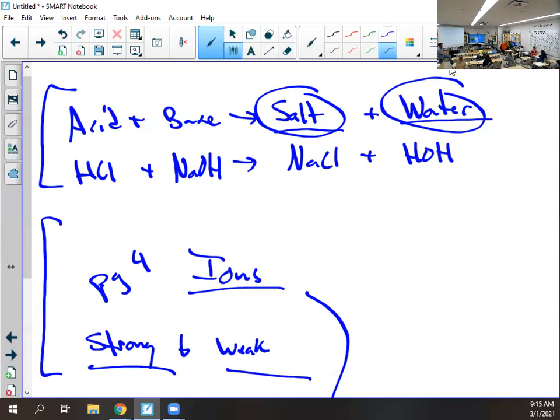That's appreciated. All right, you compare it to this and you'd say, that's probably an 11 or a 12. So far you'd have how one of those changes, the color it goes, and the number associated with it. So you'll need one of these tubes. If it looks like this, you don't need that tube. You need the one with the scale on it.